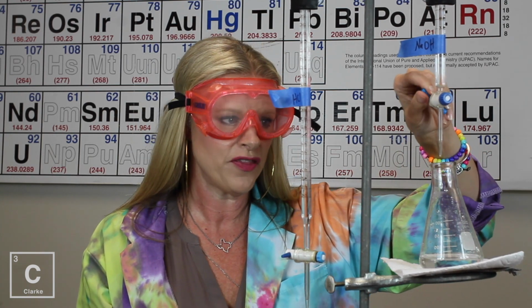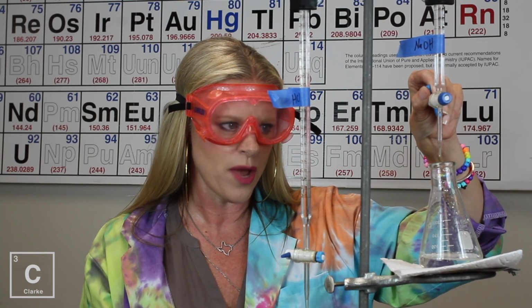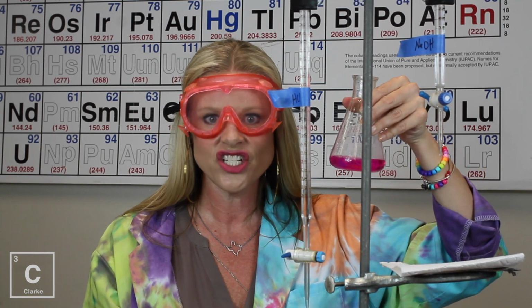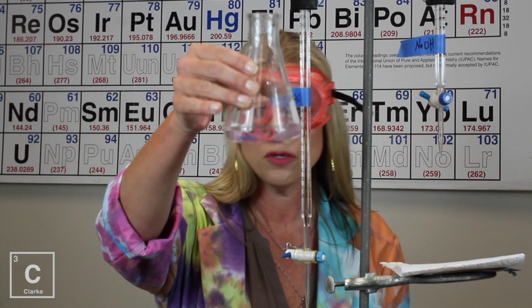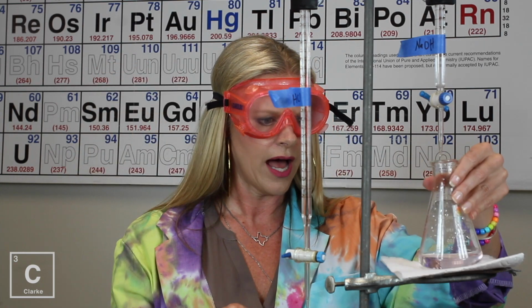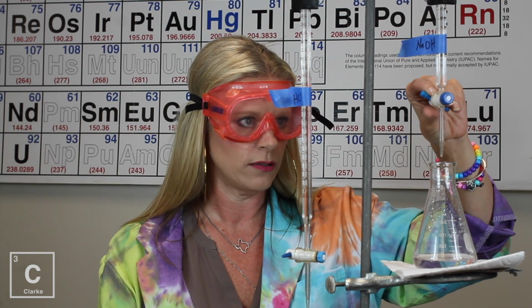There are a lot of memes out there showing the frustrations of titrations because you keep doing this for so long and you start to get a little bit frustrated, and so you add too much base because you're ready to be done, like I just did. Oh, wait a minute. There we go. I just needed to swirl it. Can we see how faint that is? Super faint. In fact, now it's starting to go away. I am so close. Let me see if I can just get one drop in.